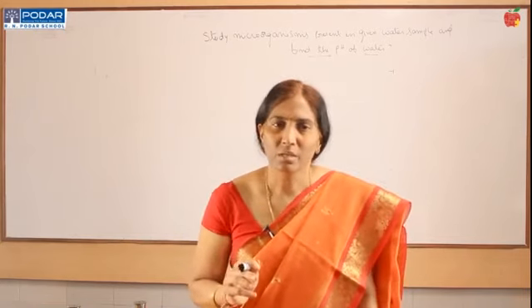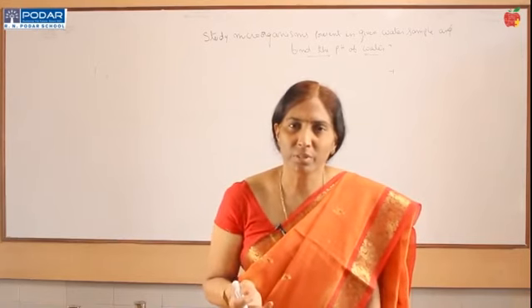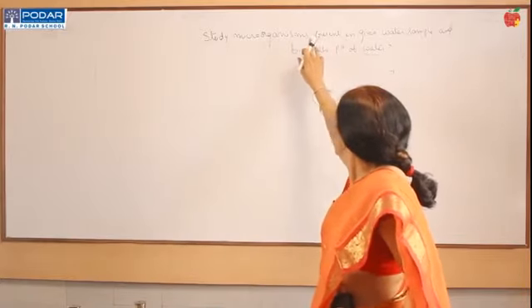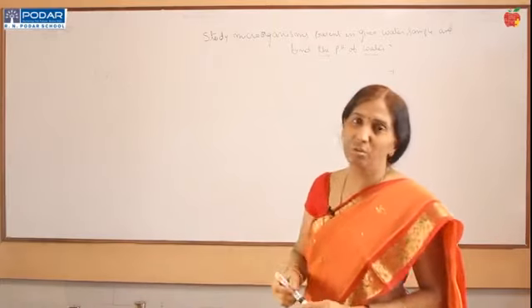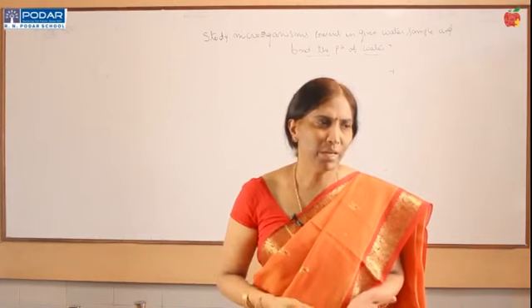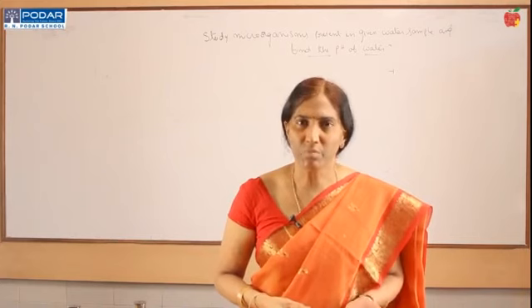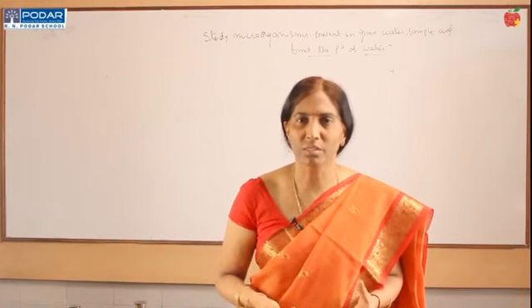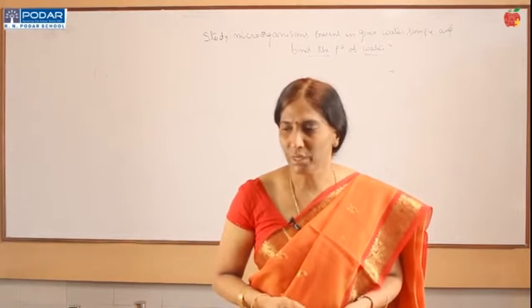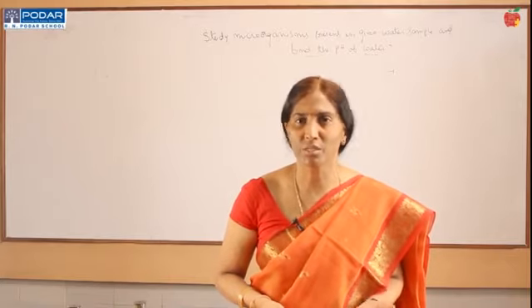Here we are going to see types of microorganisms like blue green algae, desmids, amoeba type of things, let us see. And after that, pH will also vary between the two water samples. Drinking water will have a neutral pH of 6.8 to 7, and pond water will be slightly acidic in nature, due to the presence of microorganisms, because they consume a lot of oxygen from the water, making it unfit for aquatic animals and plants also. So, let us do this experiment and find out the pH and whatever microorganisms are present in the samples.